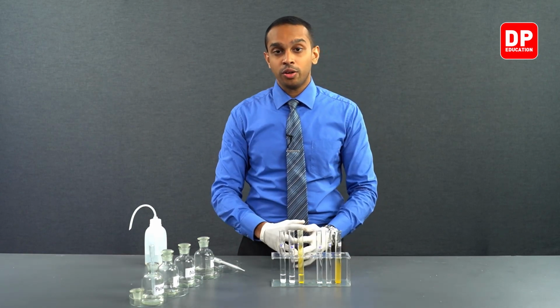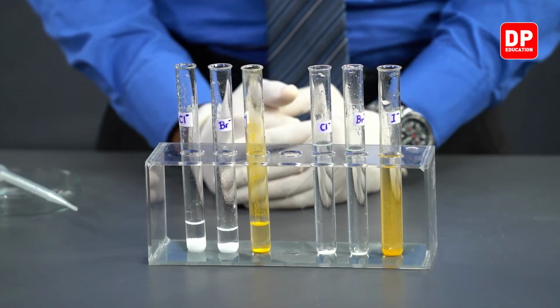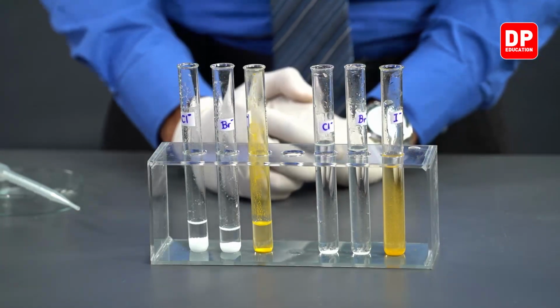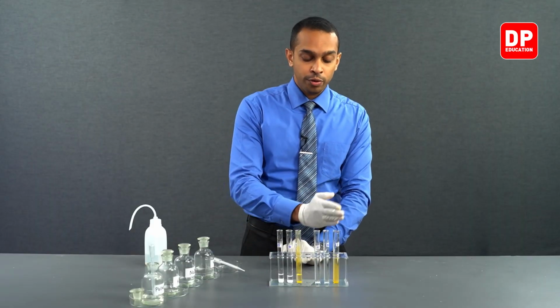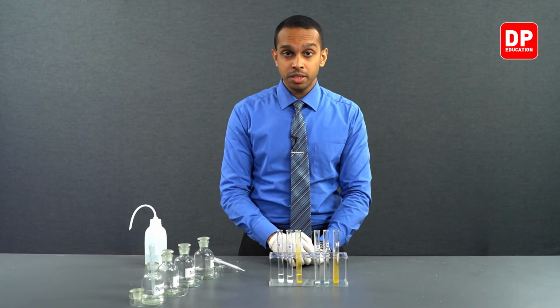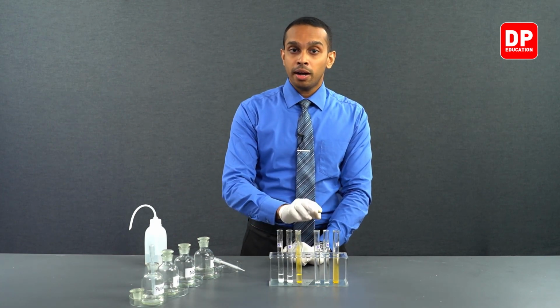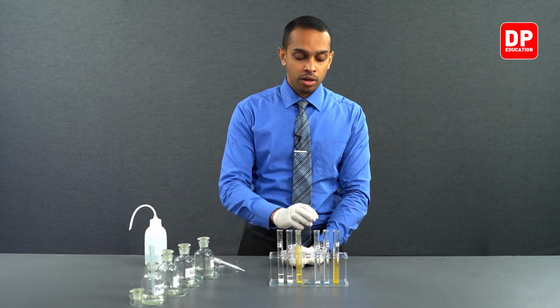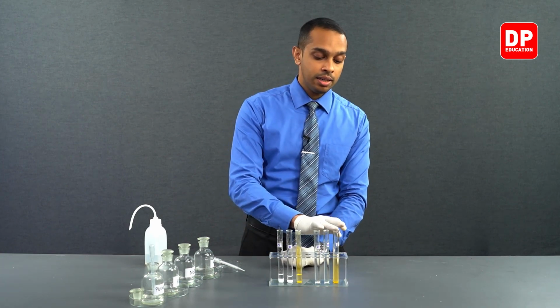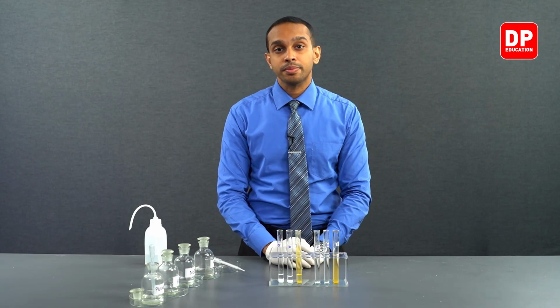So those are the observations when you take lead chloride, lead bromide, and lead iodide, and heat these precipitates. We saw all of those precipitates dissolved to form clear solutions, but upon cooling, they reform the solid precipitates: lead chloride and lead bromide, which are white in color, and lead iodide, which is a bright yellow in color.